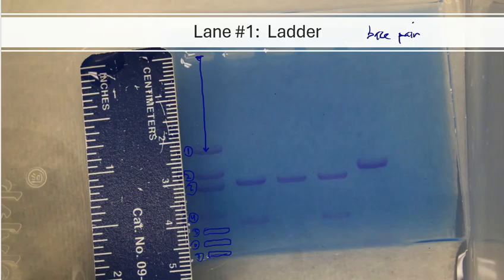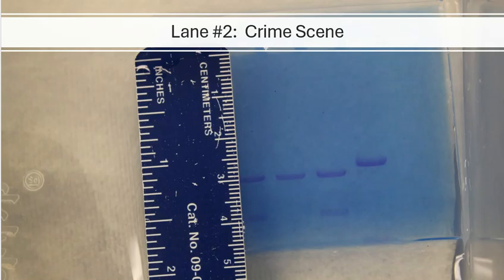All right, so there is our lane number 1, and lane number 1 is our DNA ladder, and it looks like there are 7 bands that show up in the ladder. Next one over is the crime scene. So I need to do the same thing here.